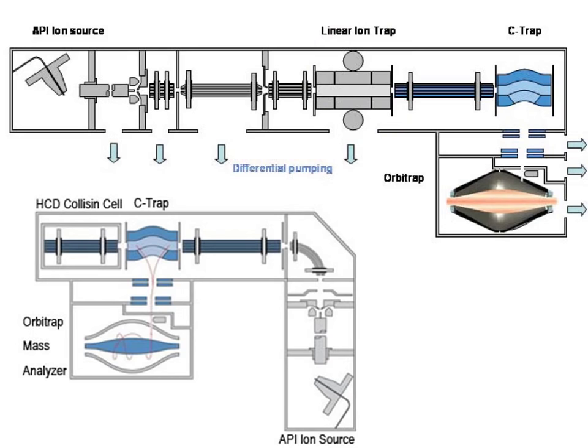Recent orbitrap-based instruments use the orbitrap for scanning a mass range to measure intact peptide mass before using a quadrupole to select a specific ion and fragmenting that ion in a separate collision cell before transmitting the fragment ions back to the orbitrap for measurement. For proteomics purposes, either a quadrupole TOF-based or an orbitrap-based mass spectrometer would give good data, but specific differences can make one type more useful for certain types of analyses.